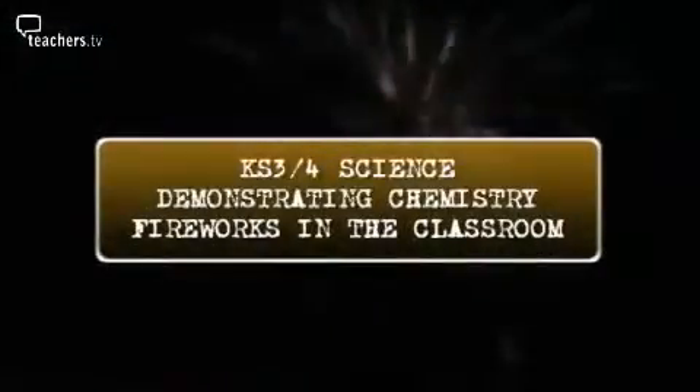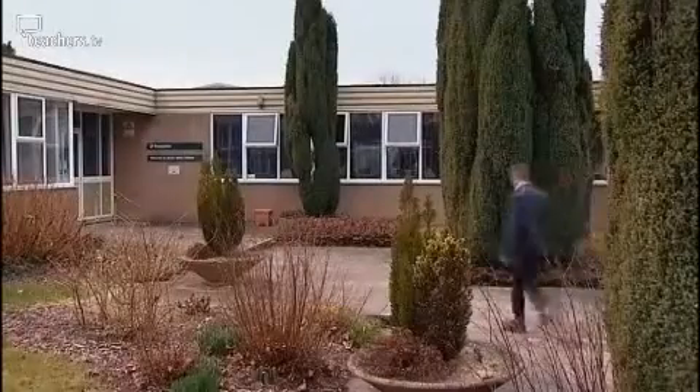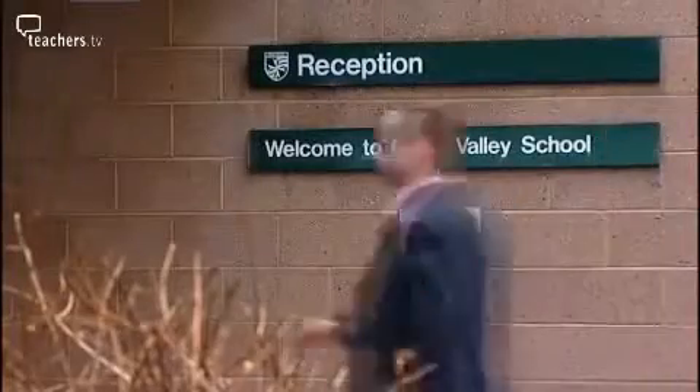As a teacher you will appreciate how exciting and engaging the topic of fireworks is. But how can you bring fireworks into the classroom safely? Well here on Teachers TV we'll show you how. We've come to Chew Valley School in Bristol and I'm going to be showing some experiments to a willing guinea pig, science teacher Trevor Thorley.